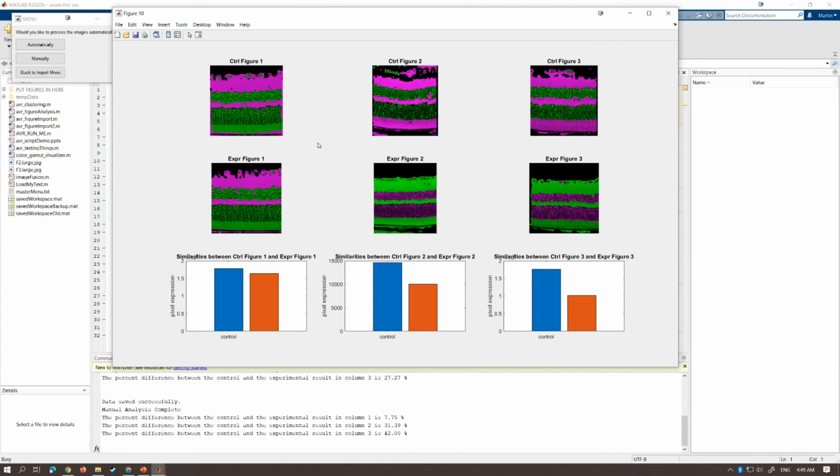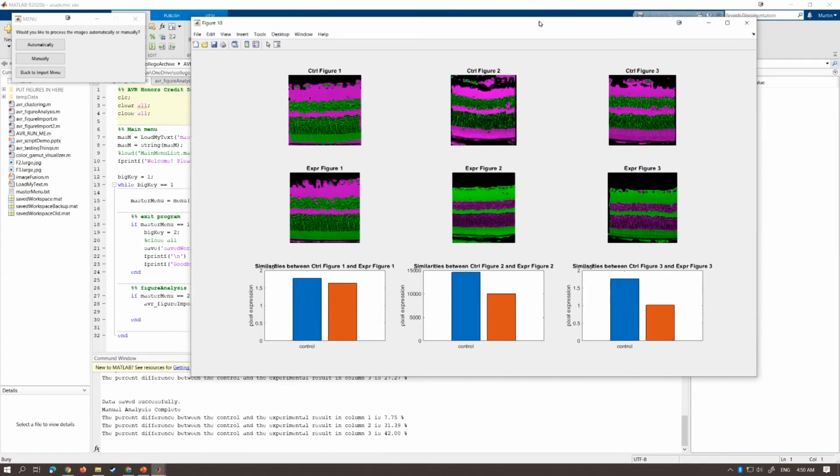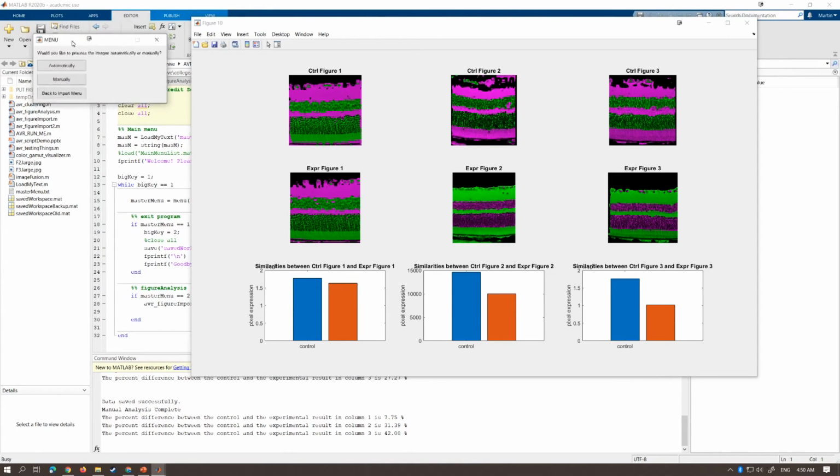So we're not getting anything that extreme, but once we get to postnatal day 30 right here, we can actually see that this has gone up significantly in the difference between these 2 images. And even though we have some impurities like what's going on up here and a little bit of text coming out, for the most part it actually does align with our data. And look, as we go to postnatal day 90, you see we are actually getting differences in these images because the experimental images, their retinas are degrading, right? The overall structure of the retina is getting smaller and smaller. Those outer segment layers of the photoreceptors, they're getting smaller and smaller too because they're decaying. So this does match up with what they had quantitatively and qualitatively provided in their report.